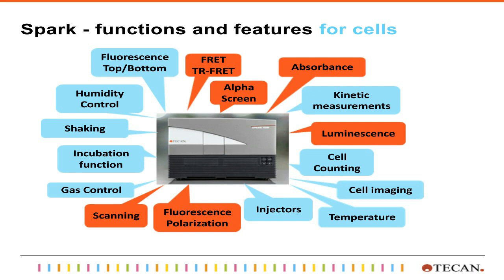It has a really useful cell imaging module, a camera module that can be used either for cell counting and viability assessment or for direct imaging to determine the confluence of a cell culture. And all of these measurements can be done in kinetic mode, so over a prolonged period of time, to monitor the response of a certain cell type in a time-dependent manner.